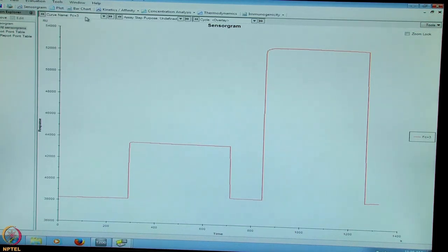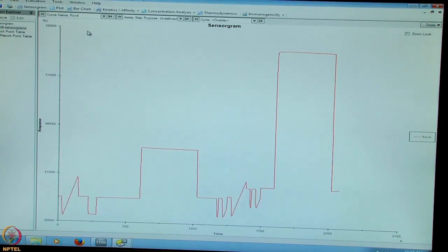Now we will go to another surface or another flow channel. Going to the next flow channel, FC4 highlighted. This is a sensorgram for active surface immobilization involving proteins. To start with, there is a pre-concentration estimation of the required amount of the ligand, wash with sodium hydroxide, activation of the surface with EDC and NHS mixture.